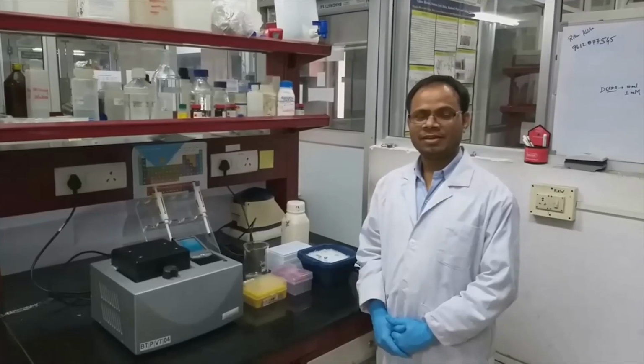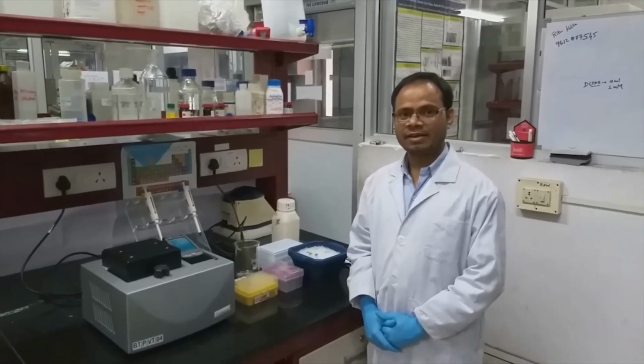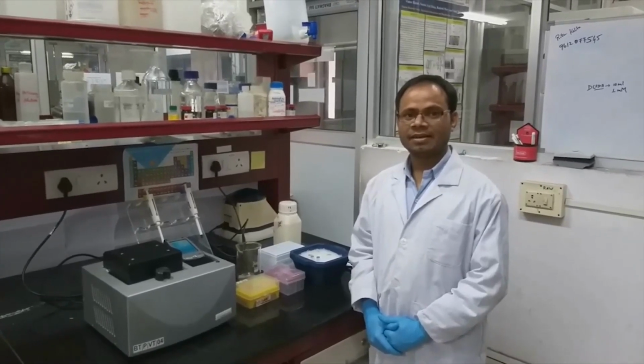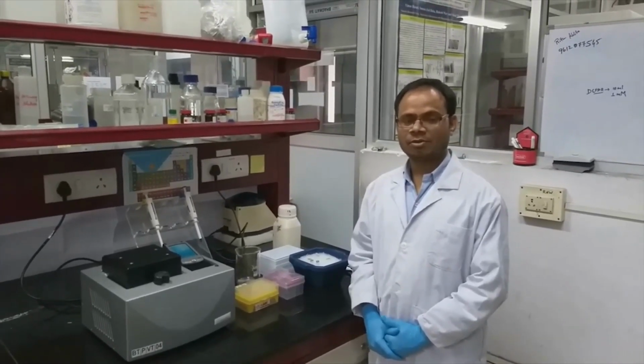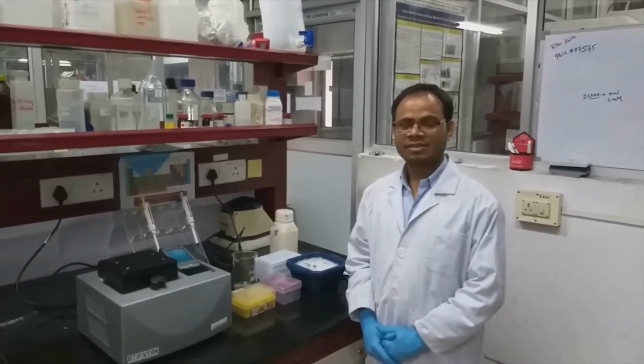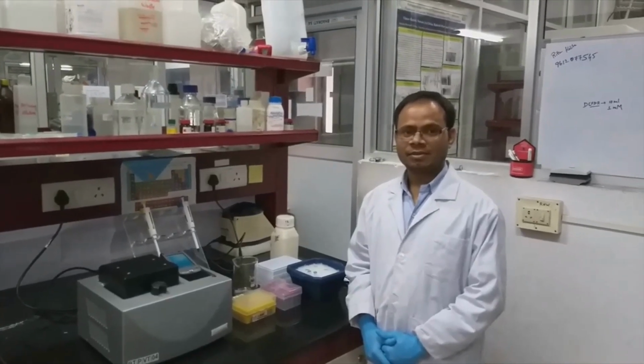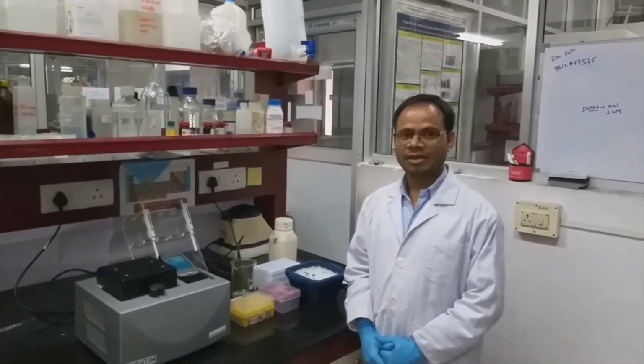Hello everyone, in this video we will be demonstrating how to set up a PCR reaction and analyze the results using agarose gel electrophoresis. PCR, or polymerase chain reaction, is a widely used molecular biology technique to amplify a particular segment of DNA.